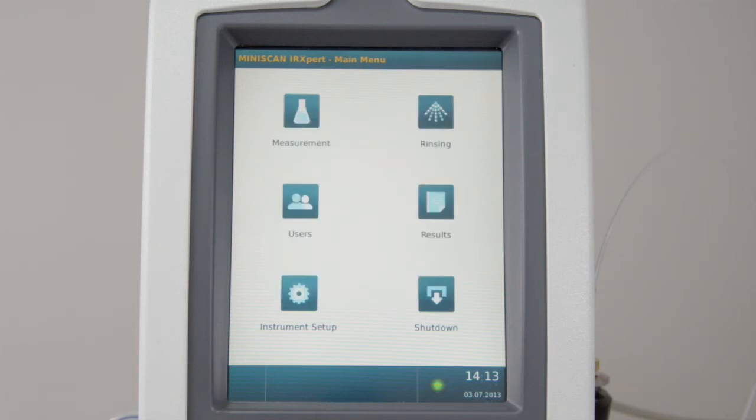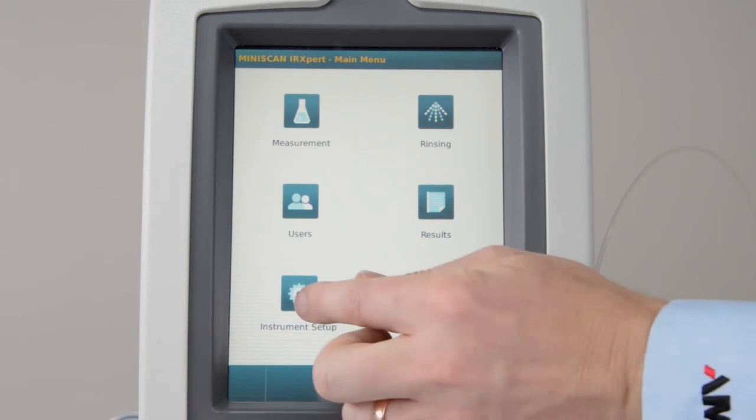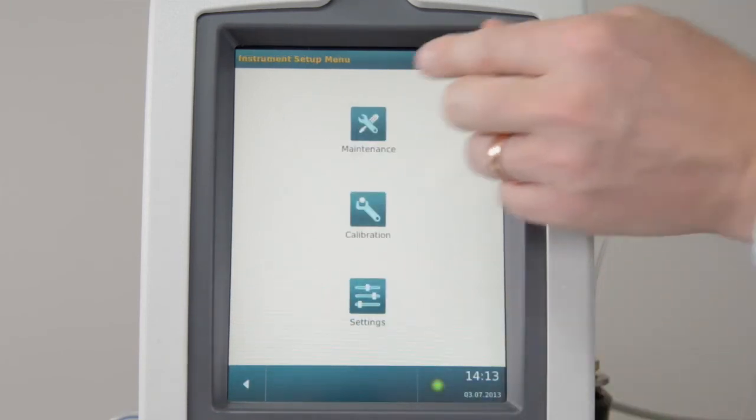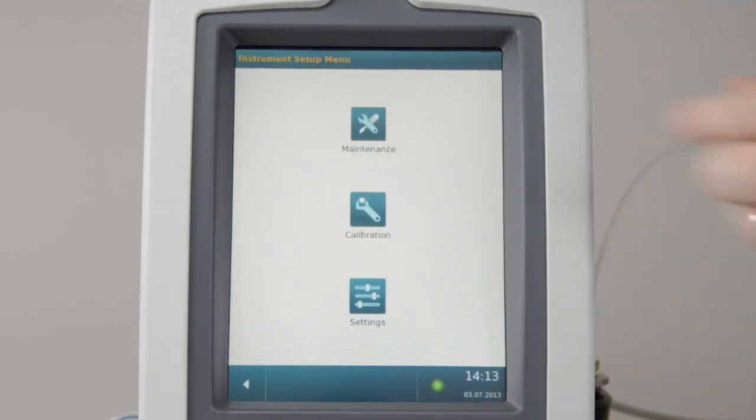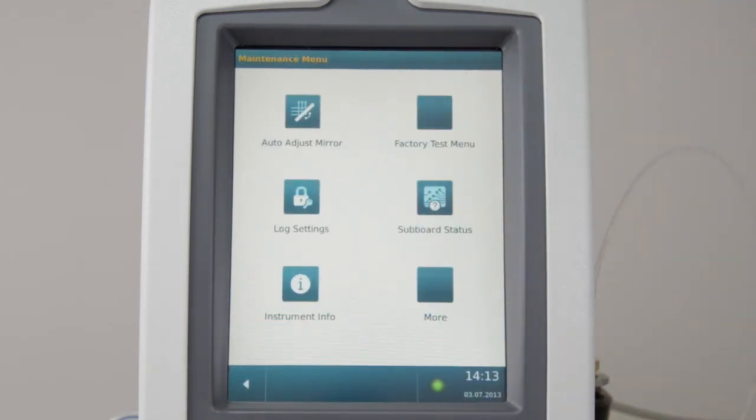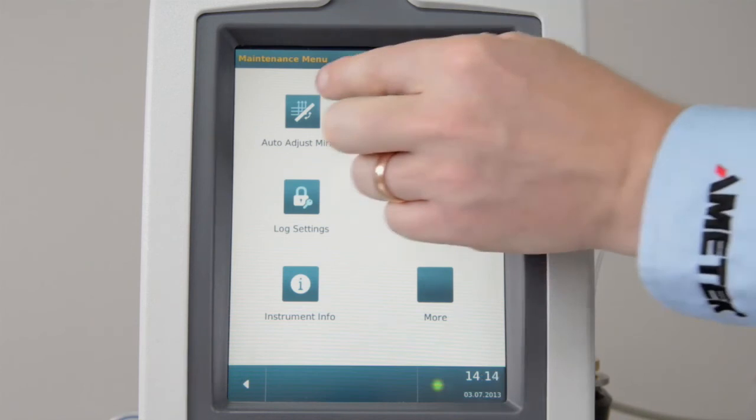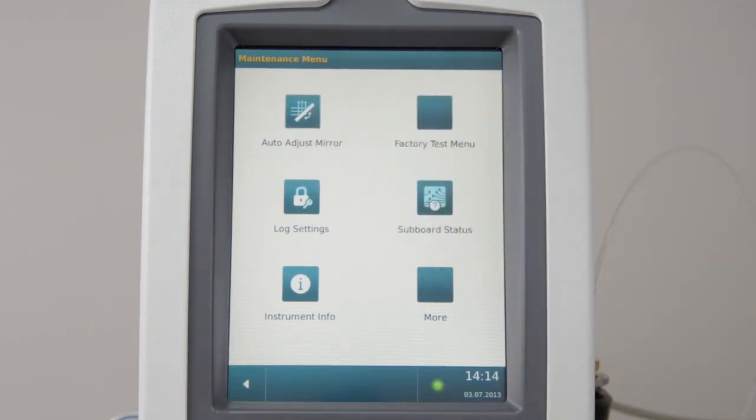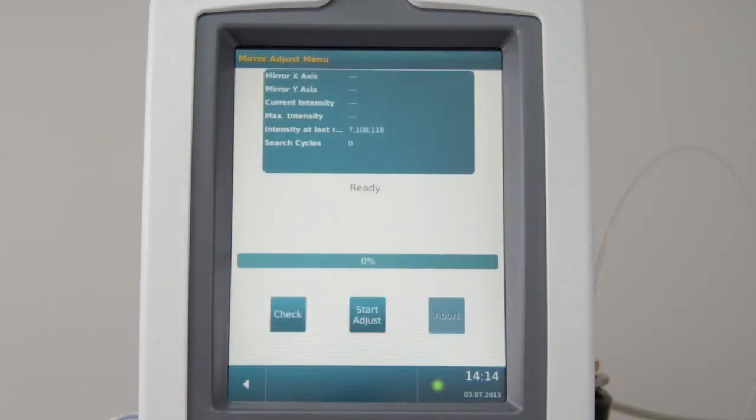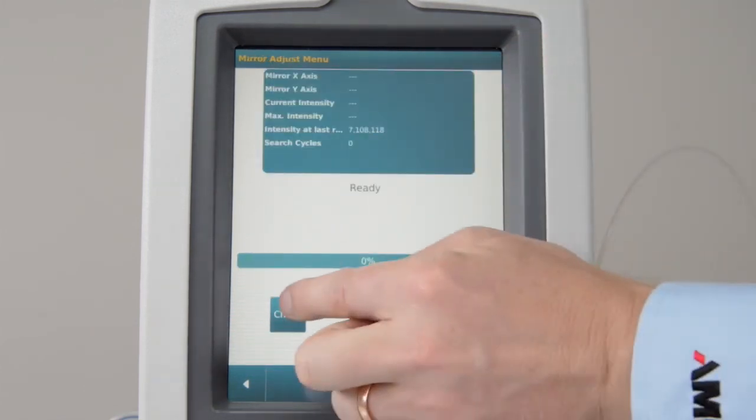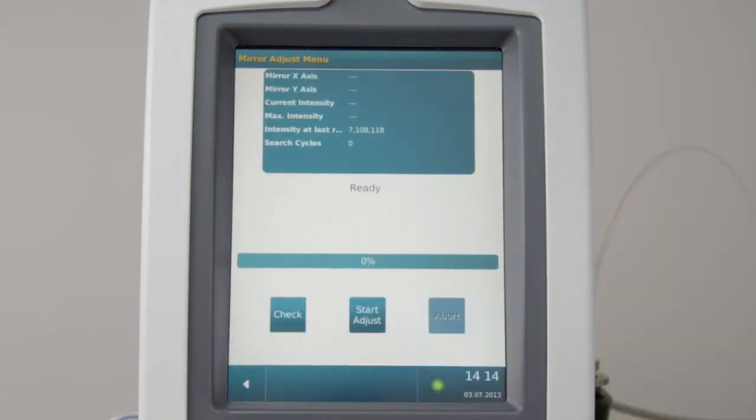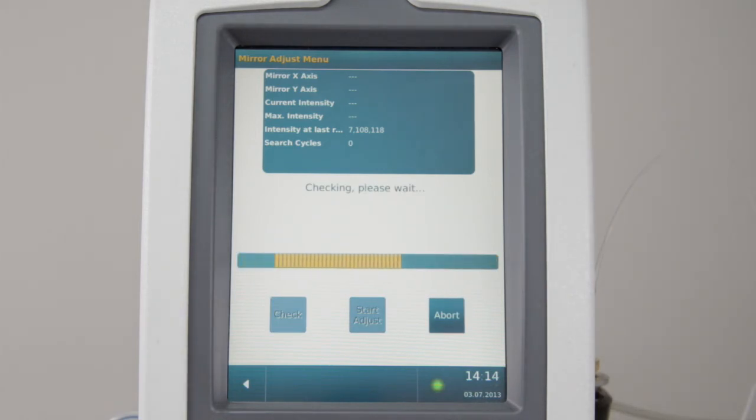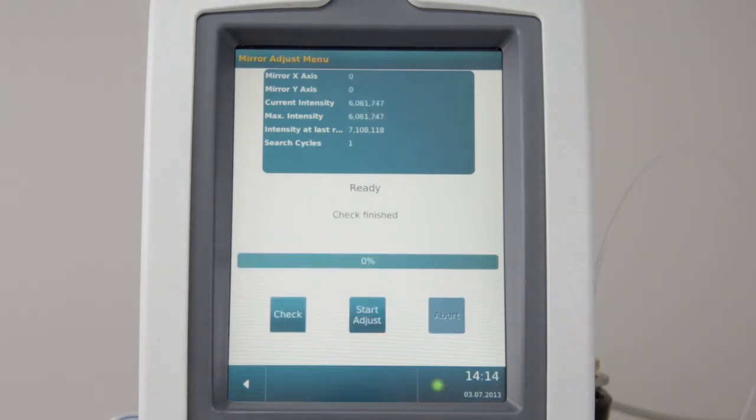To check and optimize the spectrometer intensity, go to Instrument Setup, Maintenance, Auto Adjust Mirror, and press the Check button. The resulting intensity should be higher than 4 million. If it is not, press the Auto Adjust button to optimize intensity.